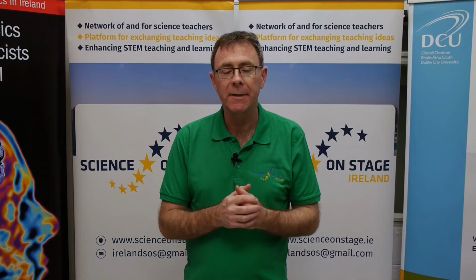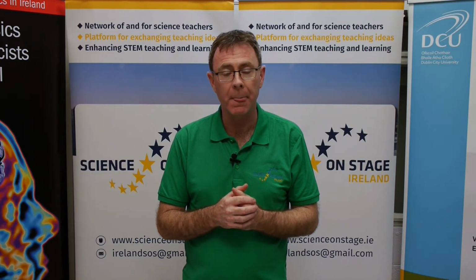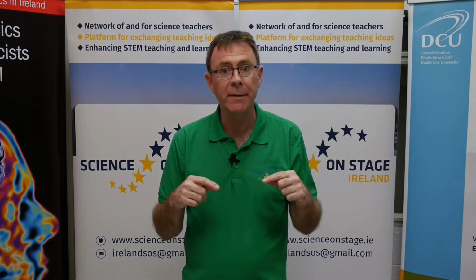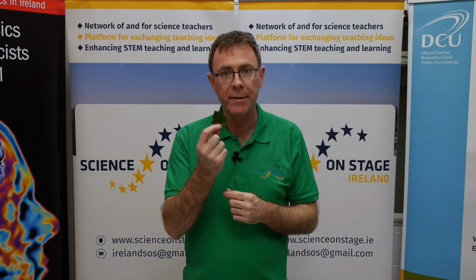So this activity is the second on photosynthesis from Ulrike Hülting from Germany, shared with us at the European Science on Stage 2019. It's the second in a series of 4. They don't have to be done in any particular order. This one is called the ivy lift, and it involves using particularly ivy leaves.